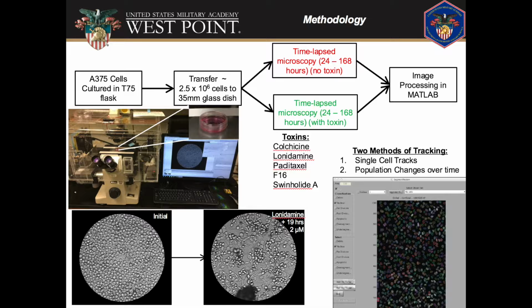The last thing we do is bioinformatics linking, which analyzes image data based on agent and dose exposure, compared and linked to any pre-existing protein and gene expression data sets in order to understand the process from time of exposure to cell death.